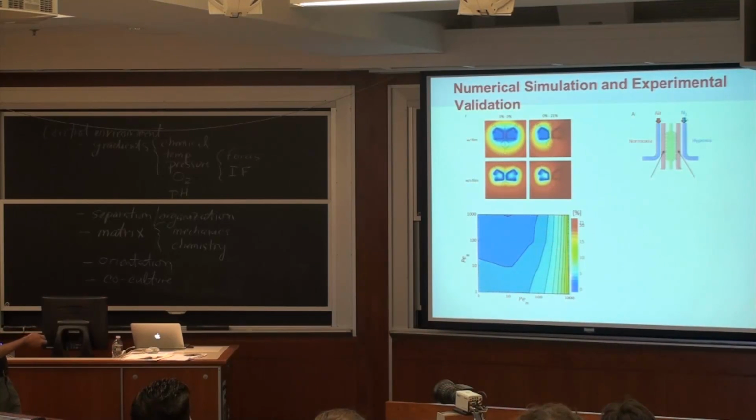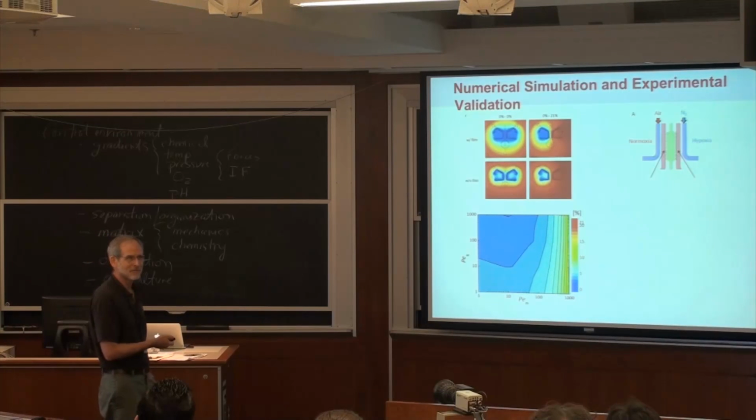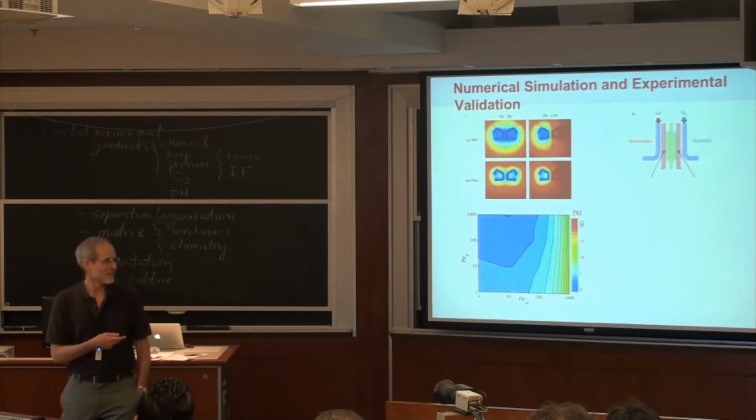And you can see that we can get down to about 2 or 3% over quite a wide range of conditions, both corresponding to relatively high gas flow rates. Okay, but these are high flow rates in terms of milliliters per hour. So one of these large tanks would probably last you about a year at these flow rates.